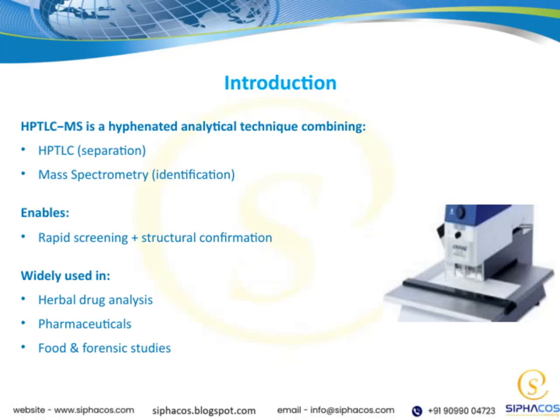Welcome to our second slide. Today, I want to introduce you to HPTLC-MS, which stands for High-Performance Thin-Layer Chromatography combined with mass spectrometry. It's a powerful hyphenated analytical technique that integrates two core processes: the separation step, which is HPTLC, and the identification step, carried out by mass spectrometry.